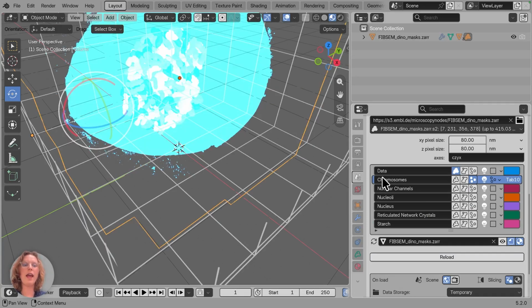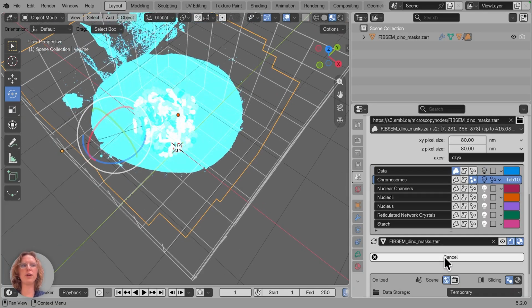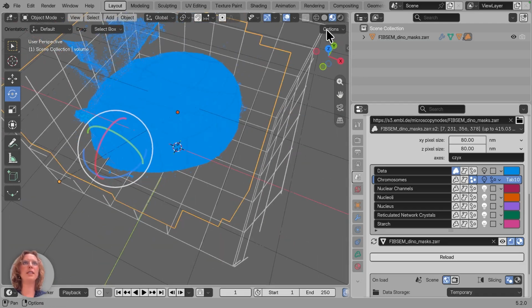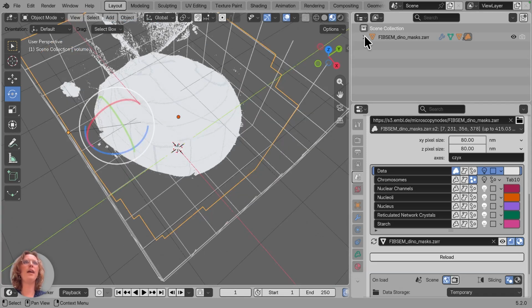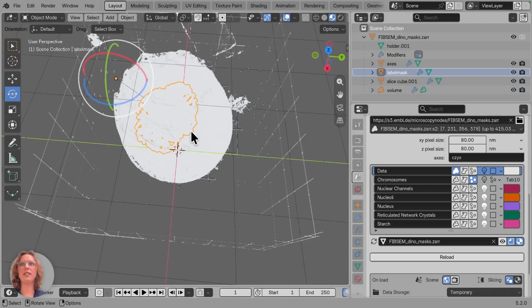And I'm going to press load. And now that I've loaded it, I realized that I wanted to turn off the light bulbs because this is dense data and it is easier to look at this in scattering. So I'm quickly going to reload, which won't remake the files, but it will just apply these settings. We can see that we now have a blue EM dataset, which we can also make white. And we also have a label mask that lives inside of this dataset.